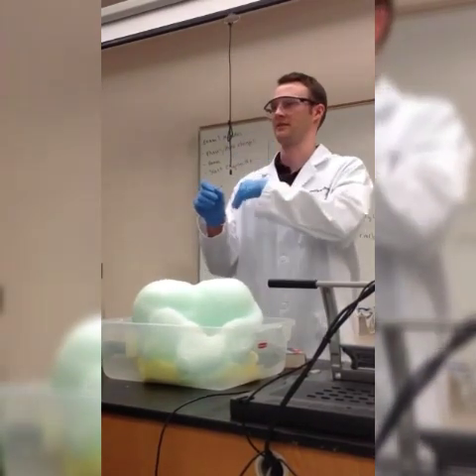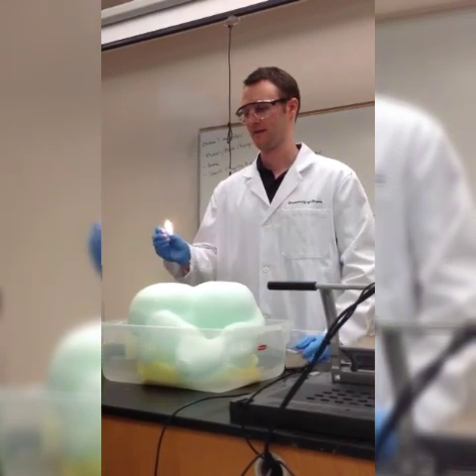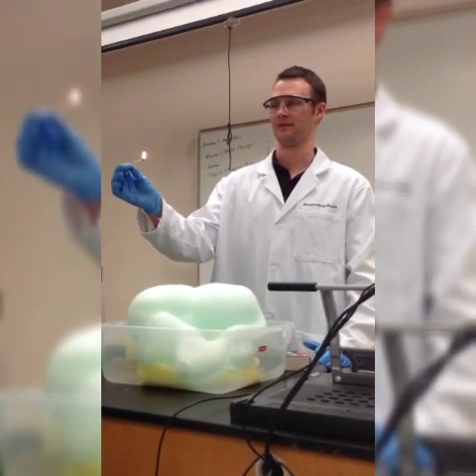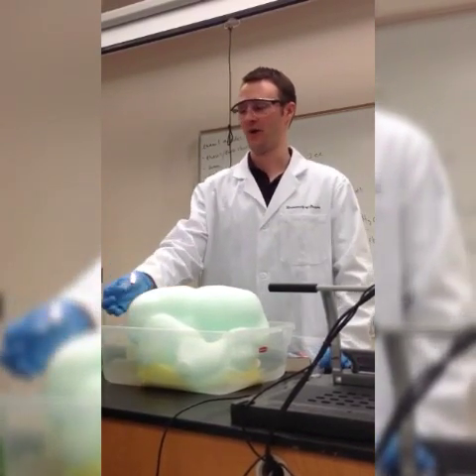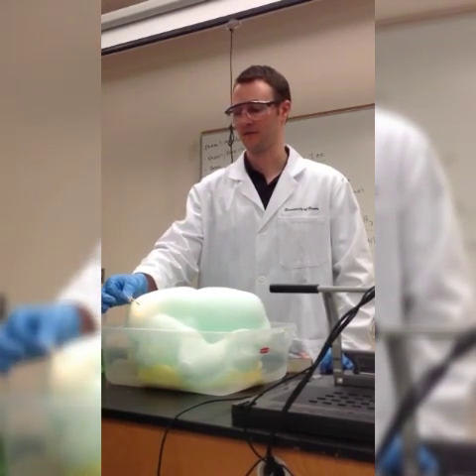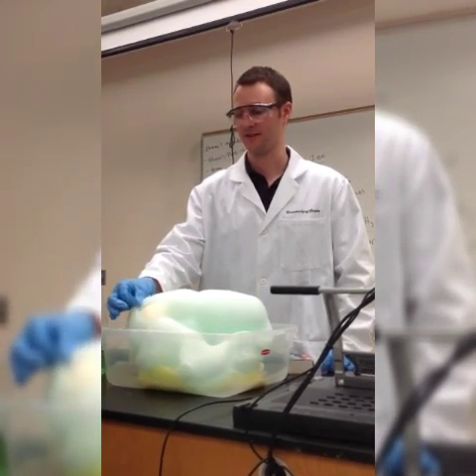Oxygen helps you light things on fire. You need oxygen in order for things to burn. Those can burn real nice with extra oxygen around. So if you look at this, you'll notice that it doesn't put it out. It just kind of starts to burn a little bit.